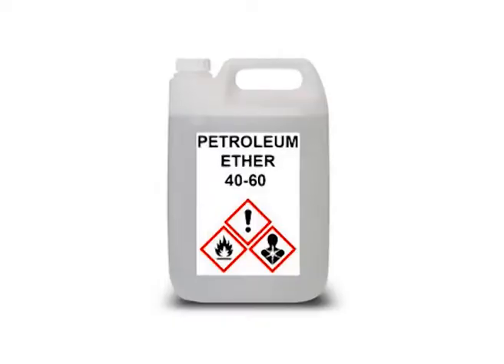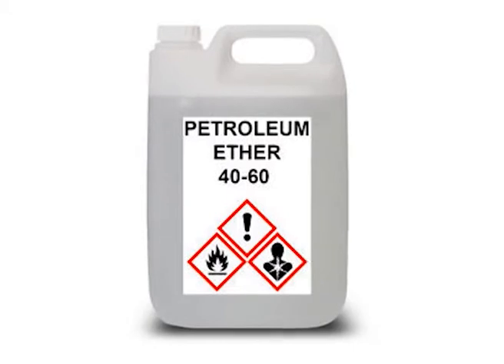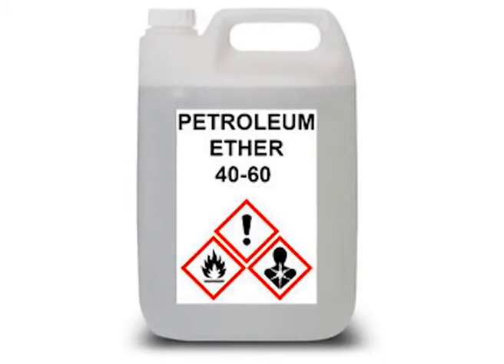Petroleum ether provides an alternative as it too does not interact with ink. However, petroleum ether is highly inflammable and explosive in nature and is therefore considered hazardous. Supercritical carbon dioxide is being considered a possible substitute of Freon 113.